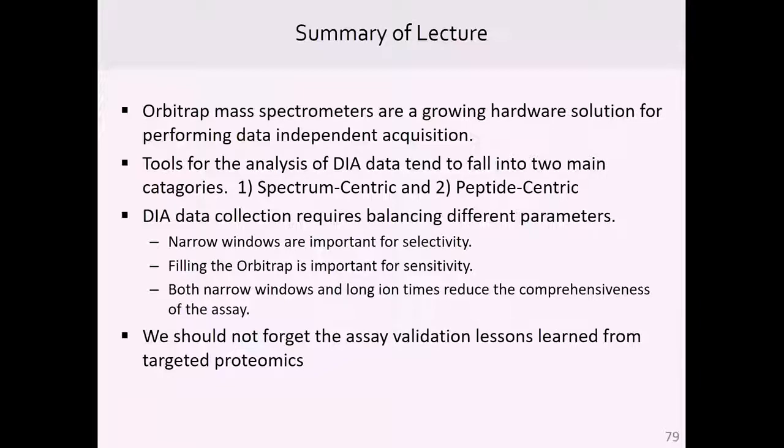Tina? So you show these nice figures highlighting that different peptides are differently digested in time. From what you show, it looks like it's always pretty much beneficial to do digestion overnight, or to do it rather longer. Or do you also have experiences that it actually is not good to do it too long? So what is your recommendation there?